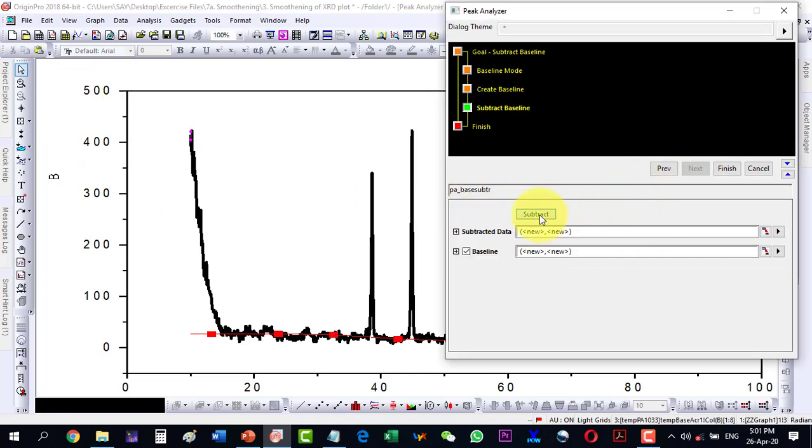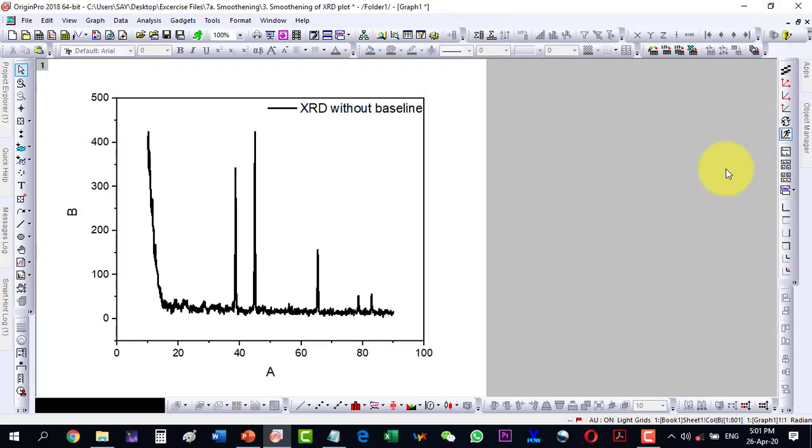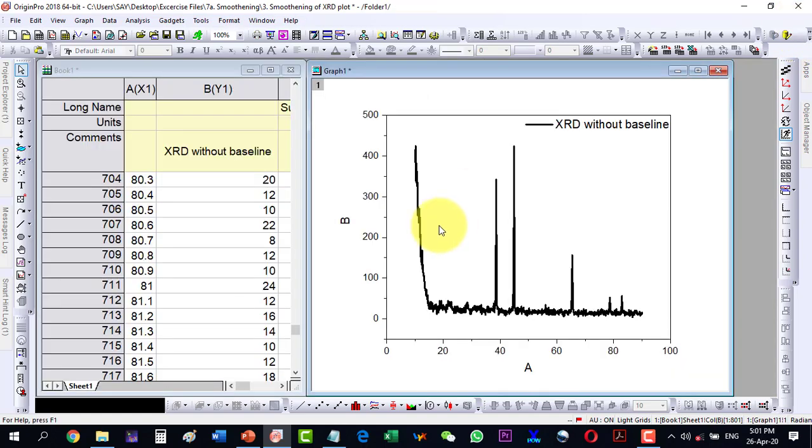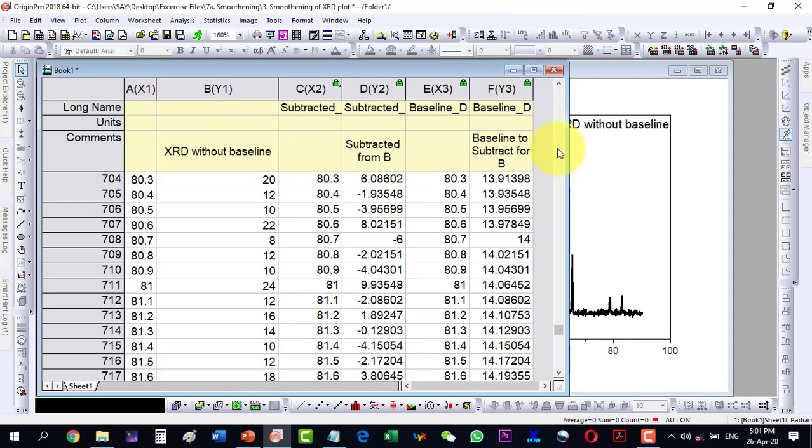And now I subtract and see that it is fine. So I finish this one. And now I can go to the data.